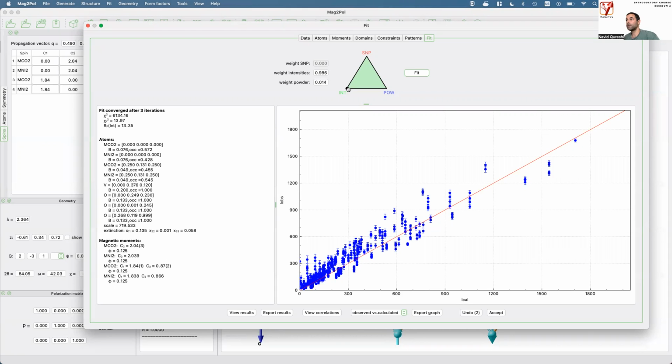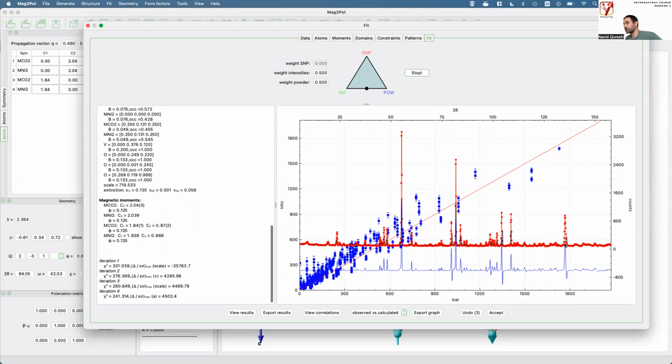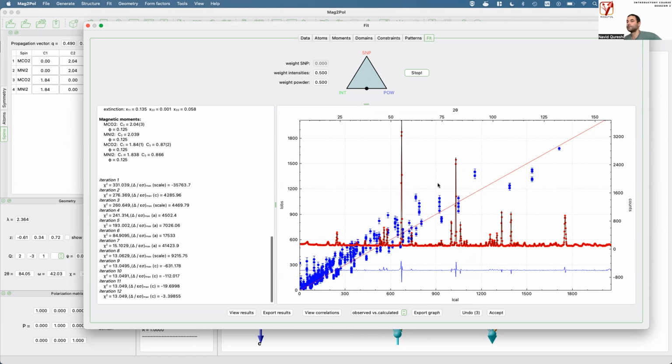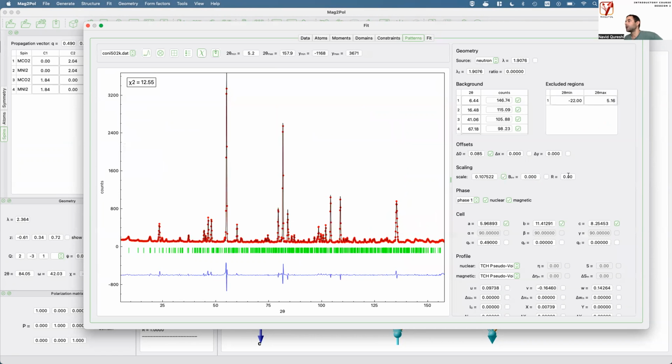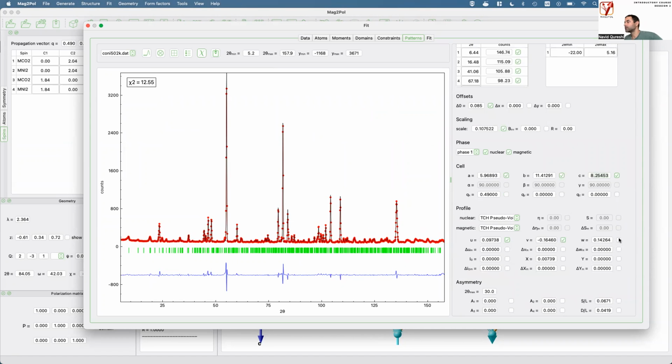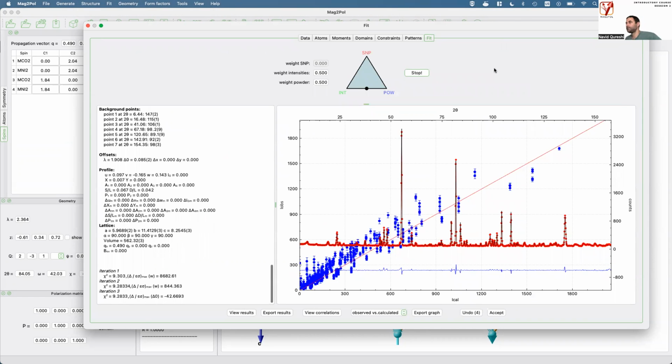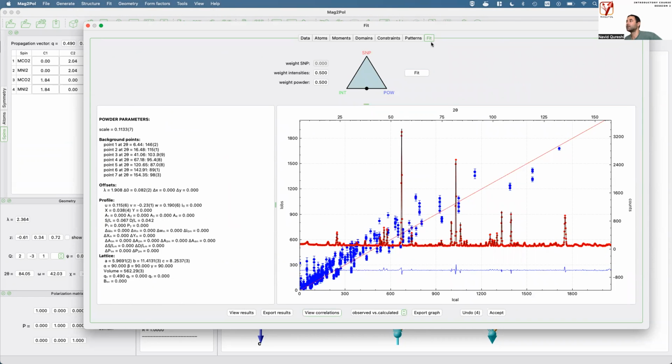So now I can grab this dot and drag it around, and it conveniently snaps in at 1/2. That's where I would leave it. If I would load polarimetry data, I could actually drag this dot over this whole weight triangle. And now I fit again. And now I see both data sets, and I can see how the powder calculated pattern gets better and better. I will add the resolution parameters to the fit. And the peak intensities became better now.